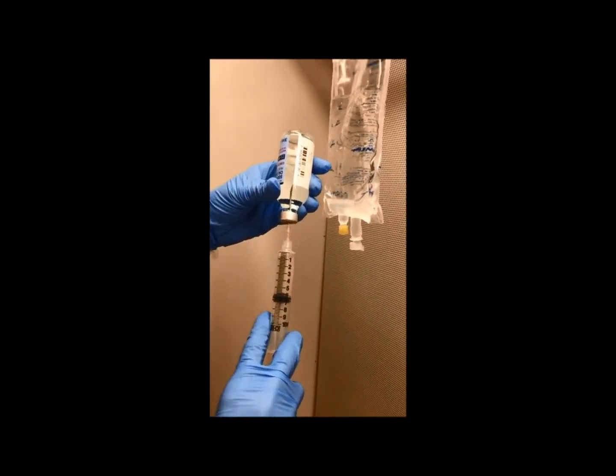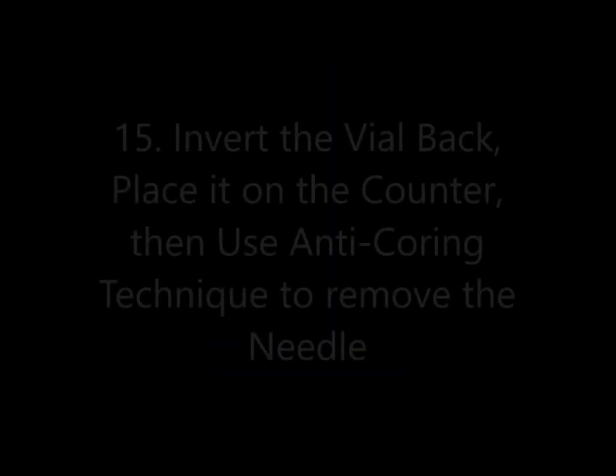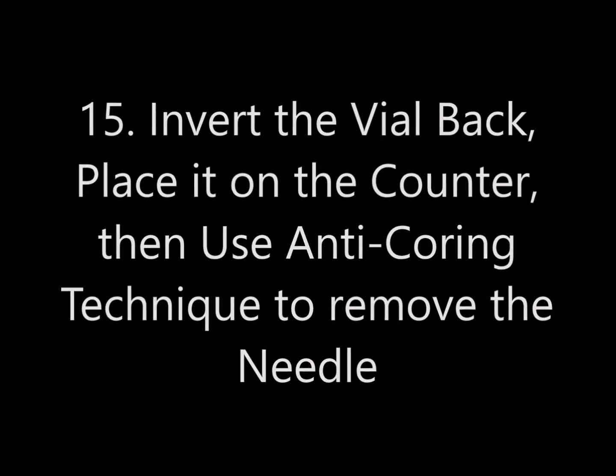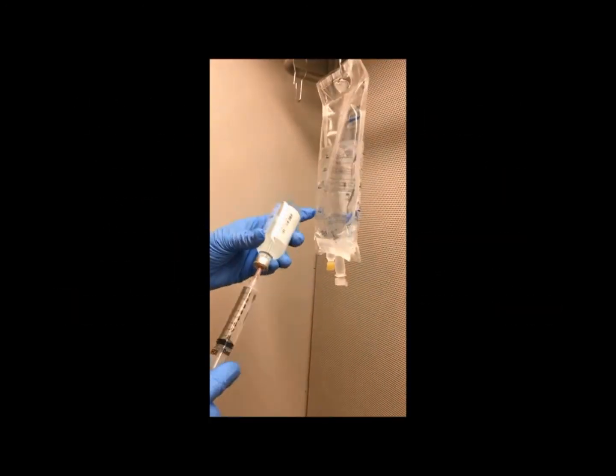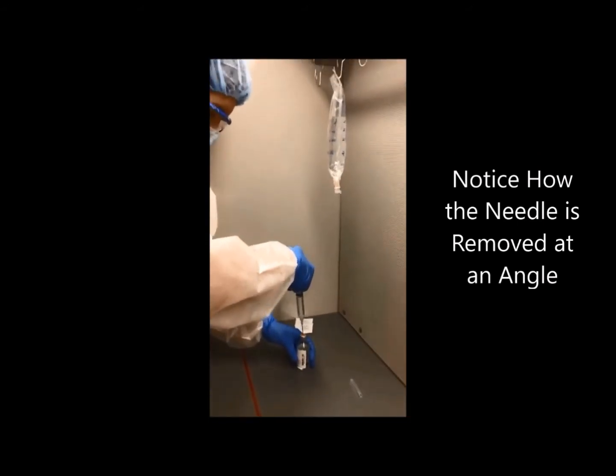Step 15: Invert the vial back, place it on the counter, then use the anti-coring technique to remove the needle. Notice how the needle is removed at an angle.